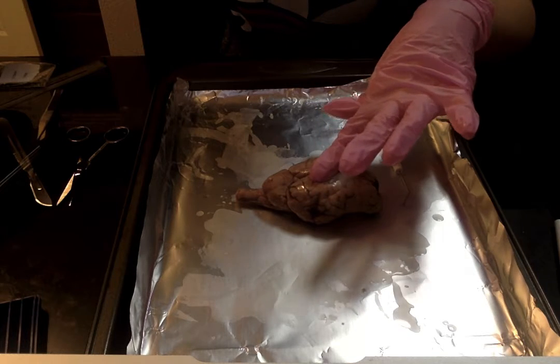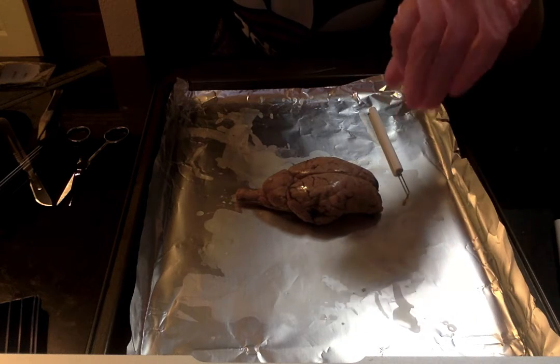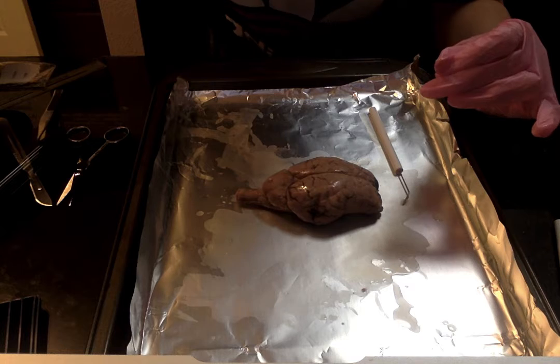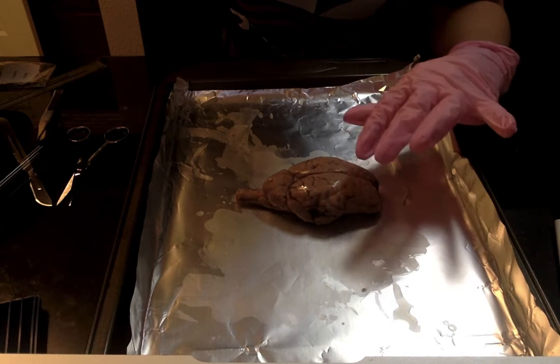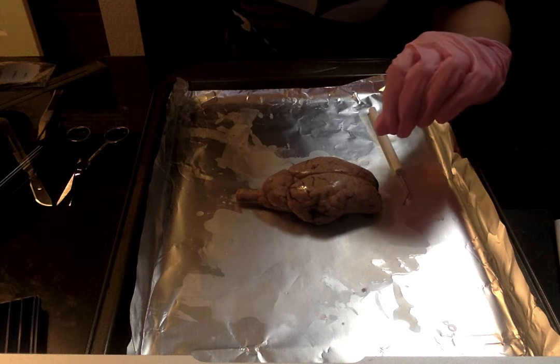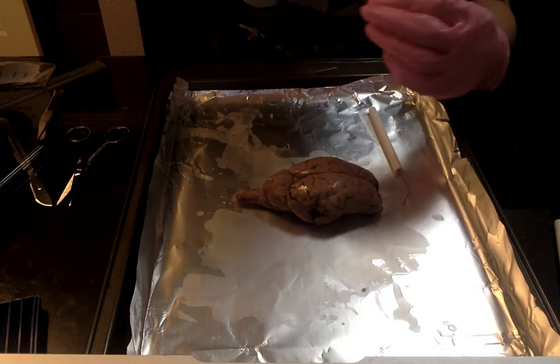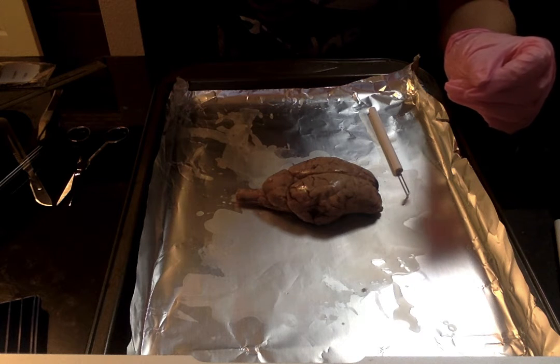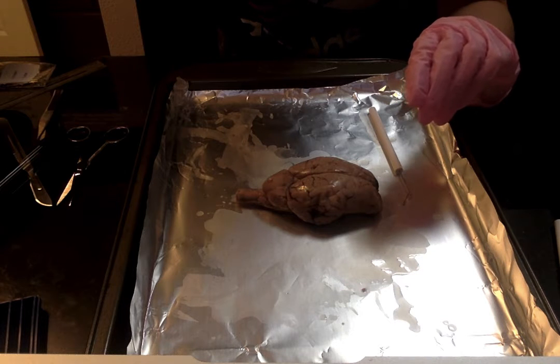The cerebellum is the structure that receives information from sensory systems such as the spinal cord and other parts of the brain, and then regulates motor movements. It also coordinates voluntary movements such as posture, balance, coordination, speech, which results in smooth and balanced muscular activity.